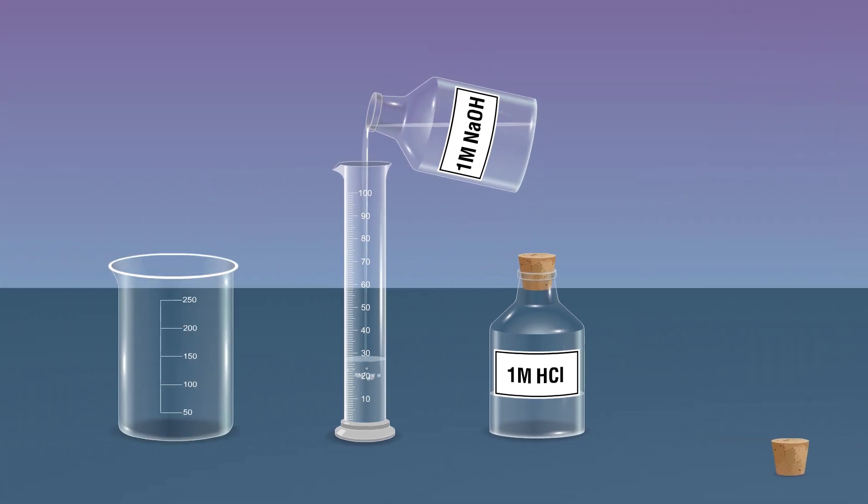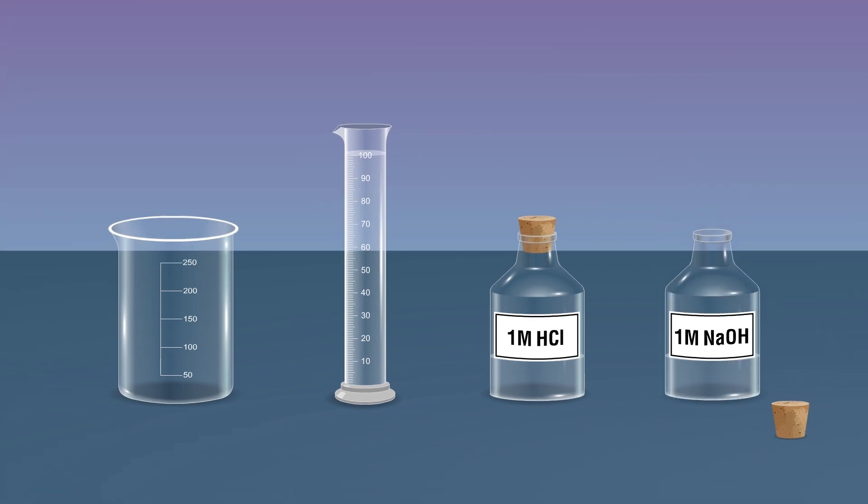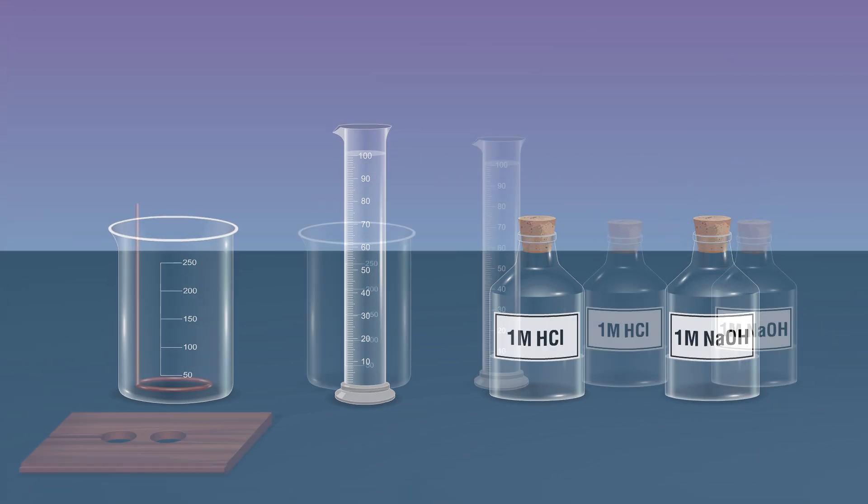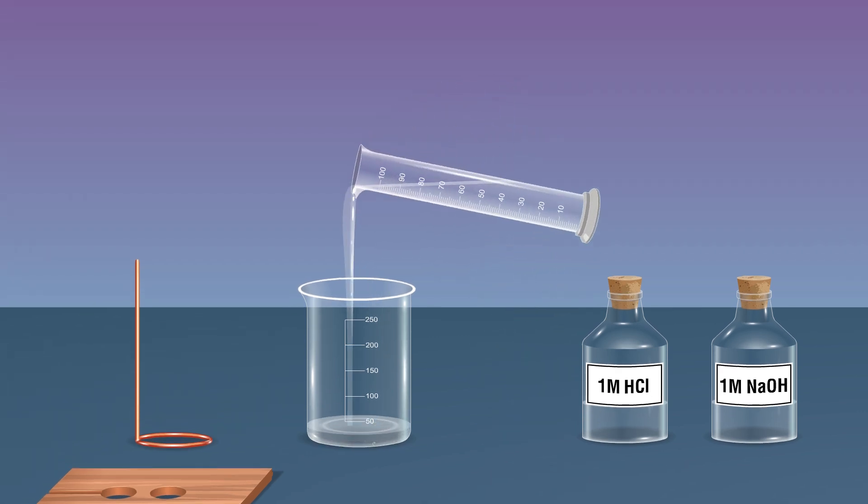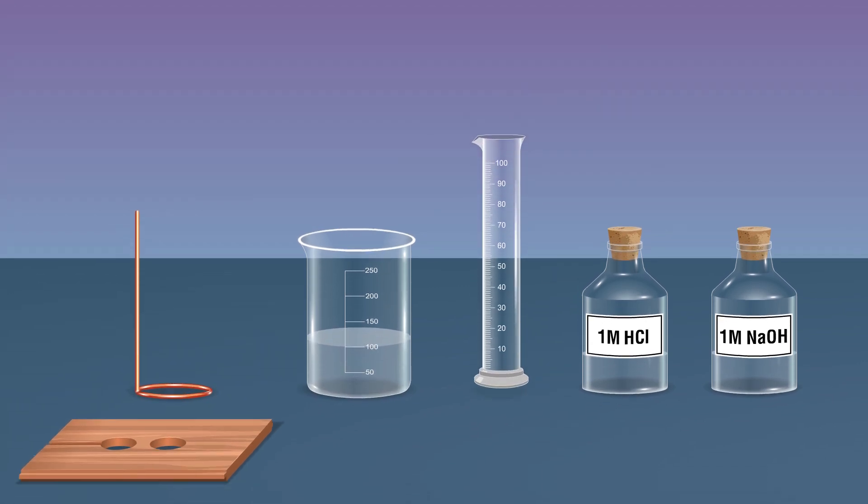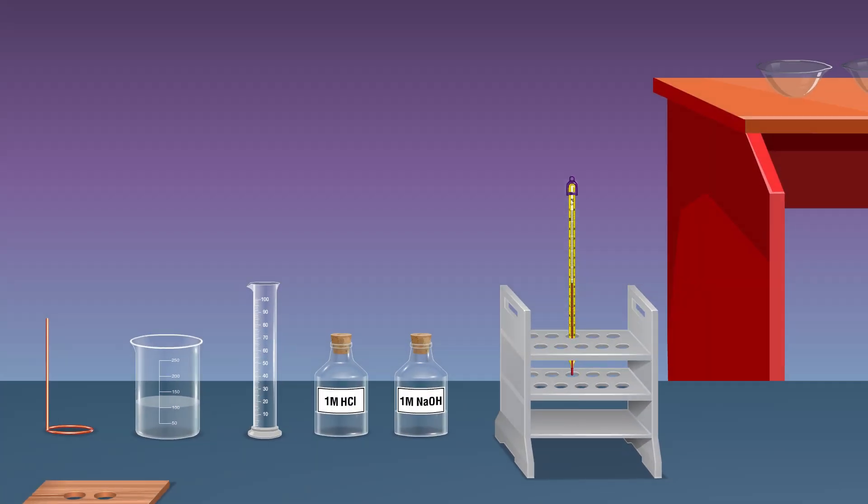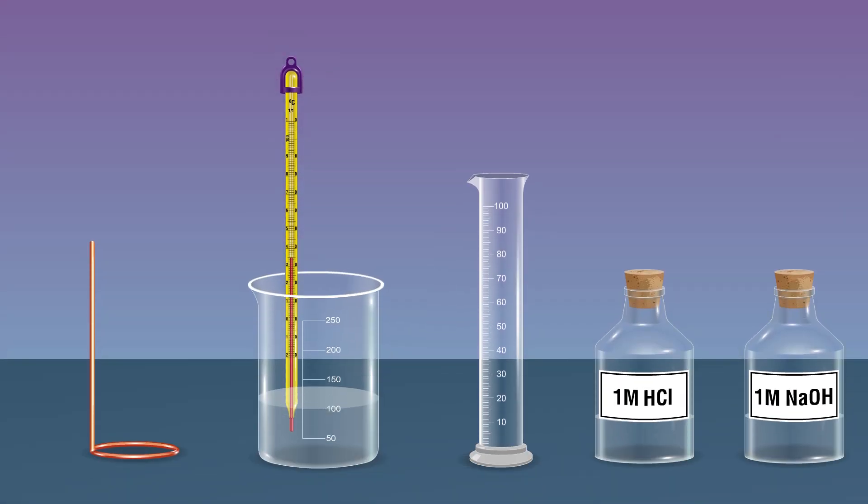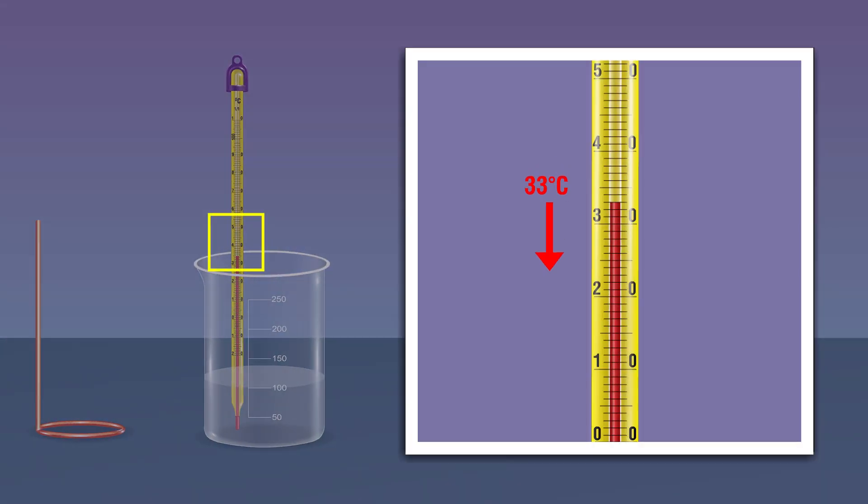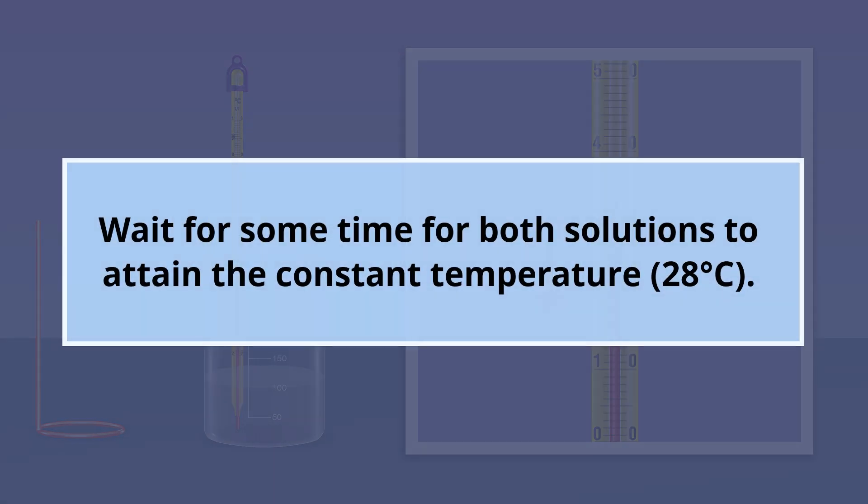Transfer 100 milliliters of 1 molar sodium hydroxide solution into a 250 milliliter beaker using the measuring cylinder. Measure the initial temperature of the base sodium hydroxide and record the data, same as T1 degrees Celsius. Wait for some time for both solutions to attain the constant temperature of 28 degrees Celsius.